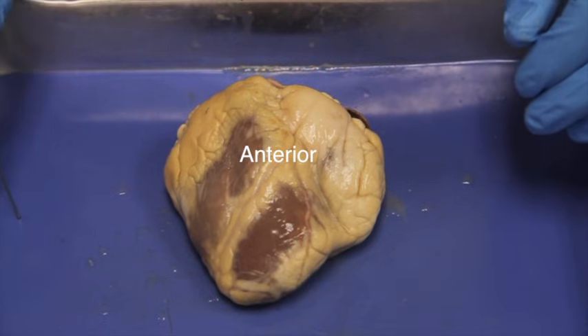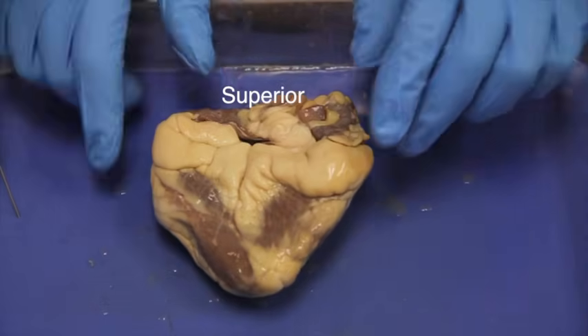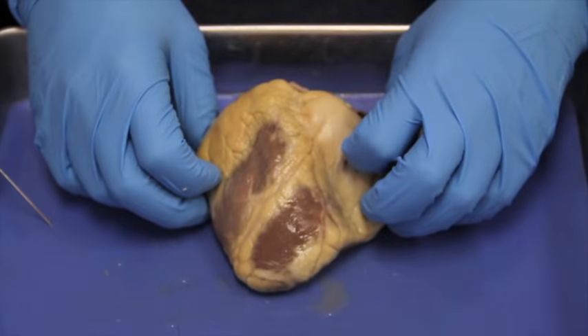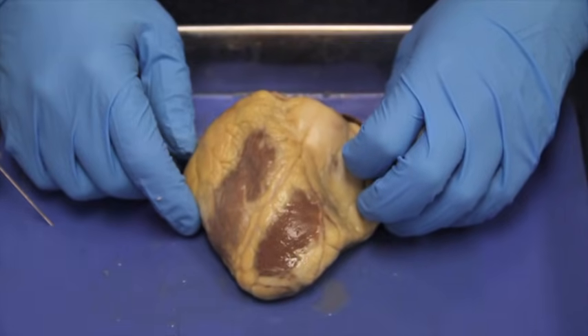So this is the anterior side. We've correctly oriented our heart. We know anterior, posterior, inferior, and superior.